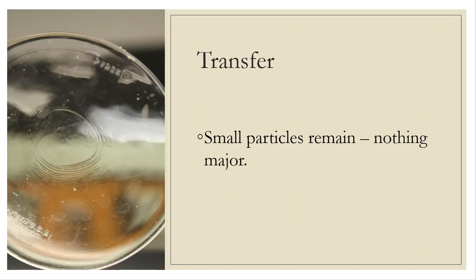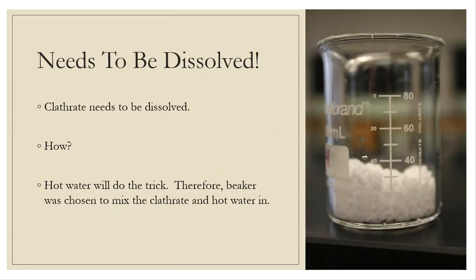Through the transfer step, I do have a little bit of remnant that's left over on the watch glass, but no big deal. It doesn't look like a lot, but I at least did take a picture of it to show you that we probably did lose some of it at this point yet again. That's the problem with transfers. Every time you do a transfer, you're going to leave some stuff behind if you're not careful. All right, so all of that stuff needs to be dissolved in that beaker.